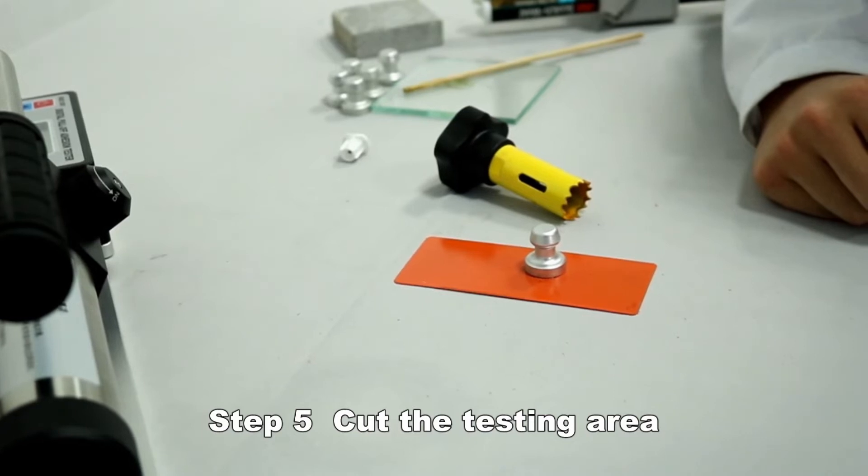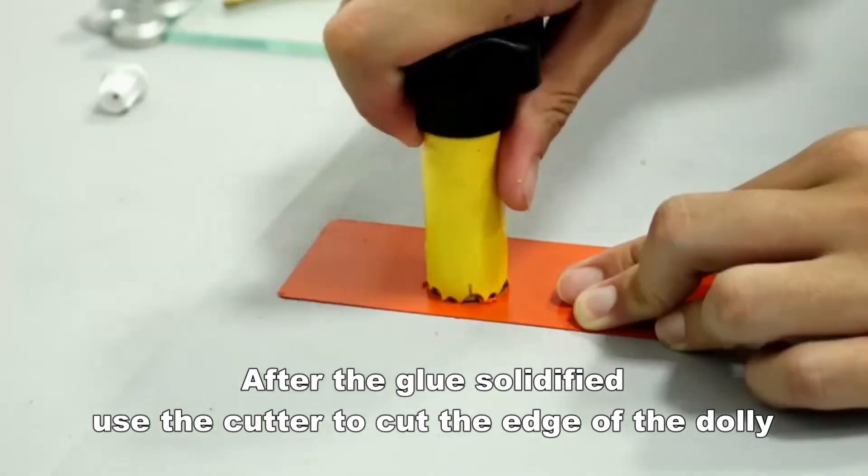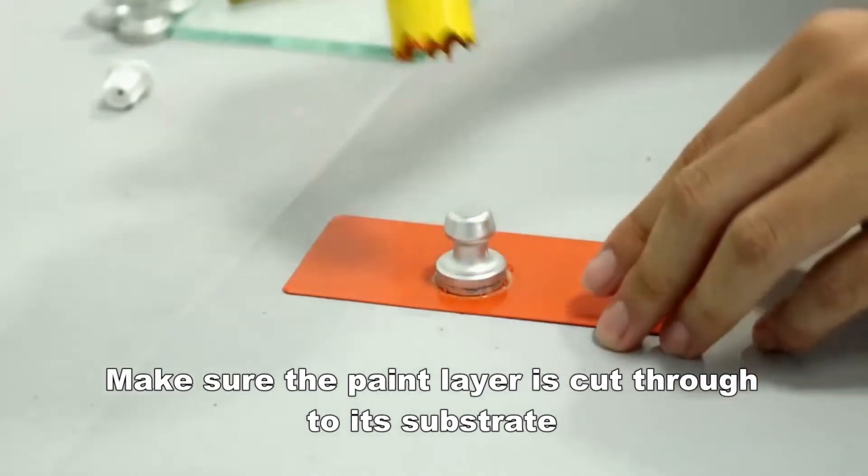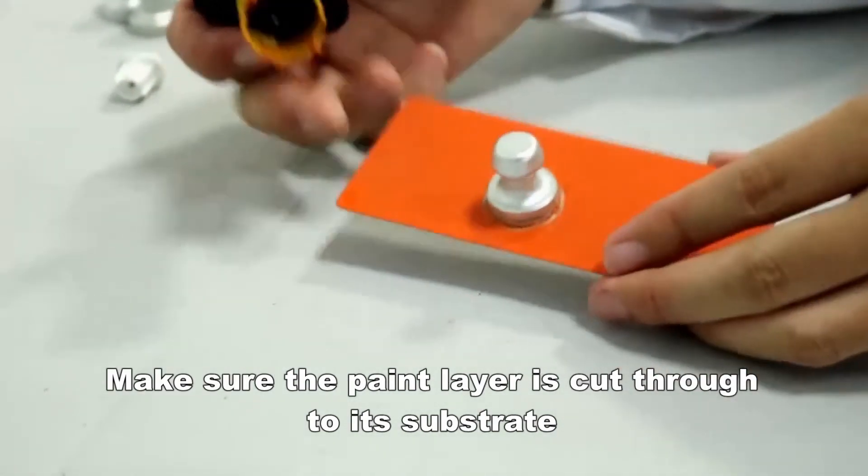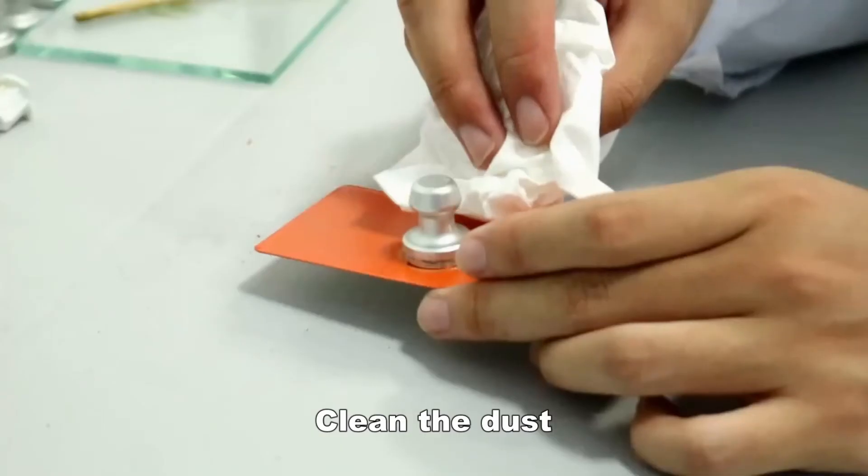Cut the testing area after the glue is solidified. Use the cutter to cut the edge of the dolly. Make sure the paint layer is cut through to its substrate. Clean the dust.